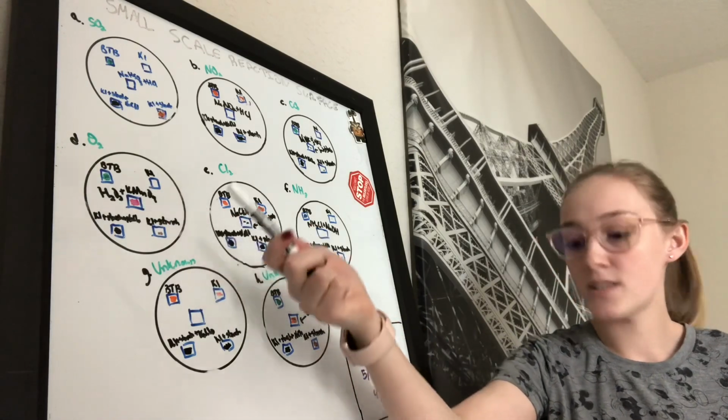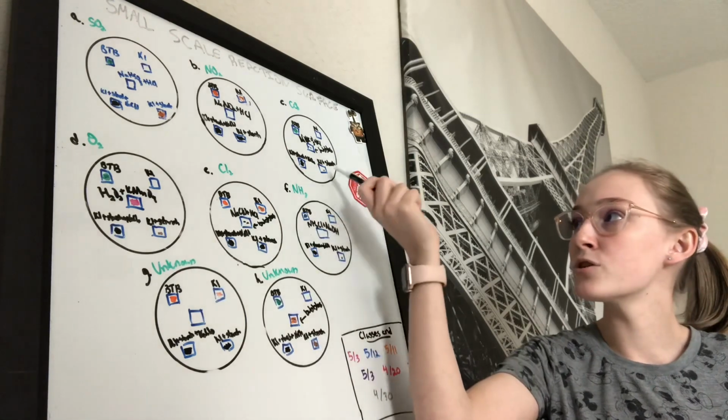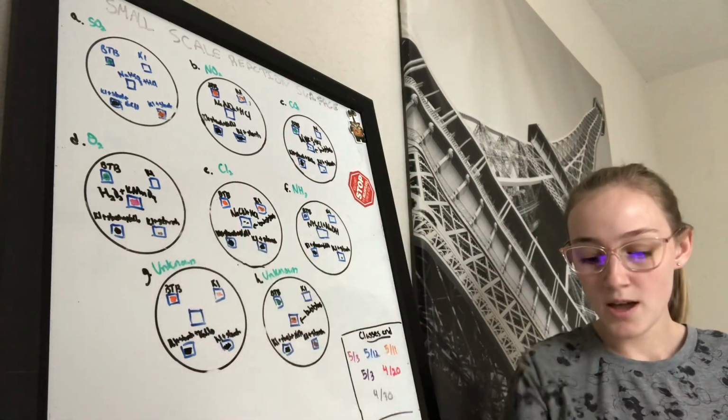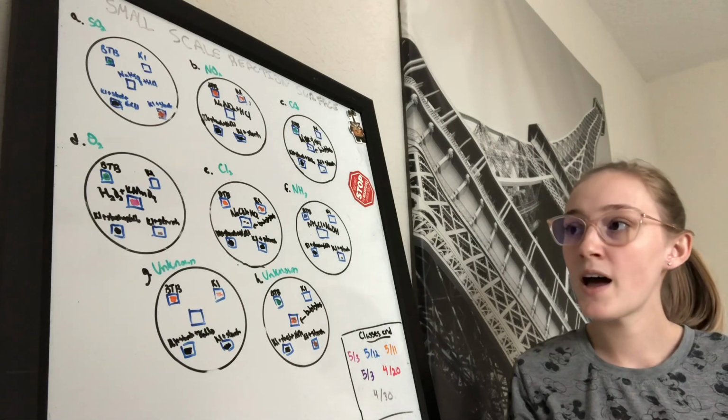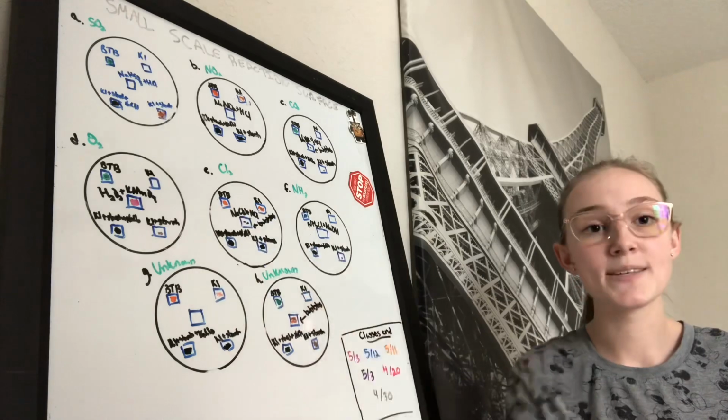So now for reaction D, this one stayed the same. You had the KI stayed the same. The KI plus starch turned into a darker color similar to what it did here, and then you have that black that stayed the same. And so with that, you can come to the conclusion that it was O2 gas.